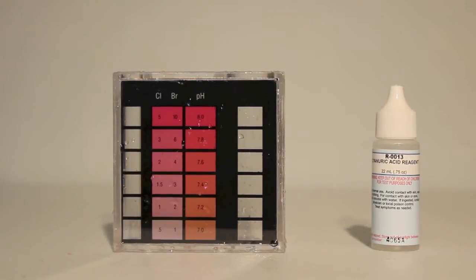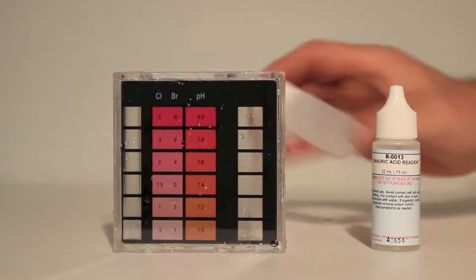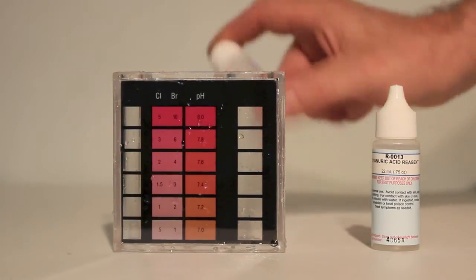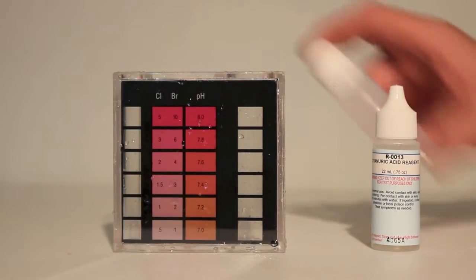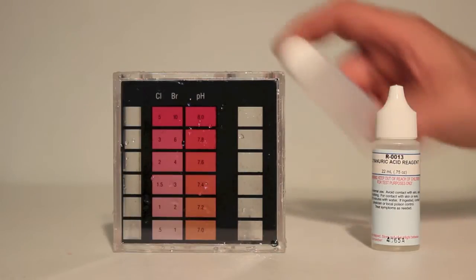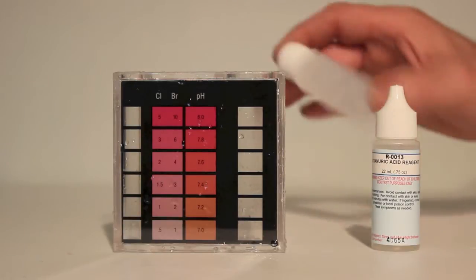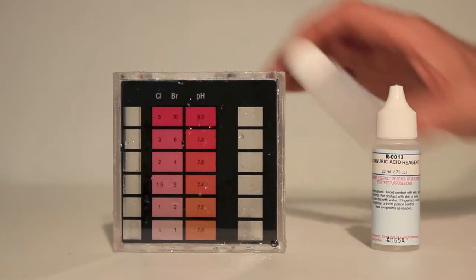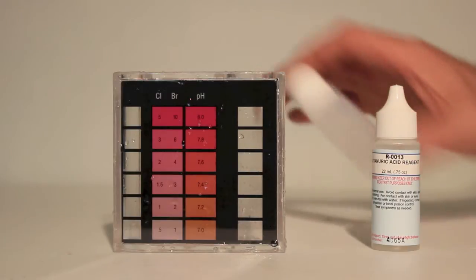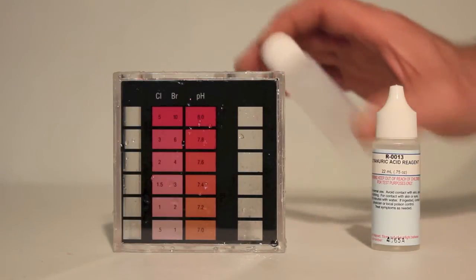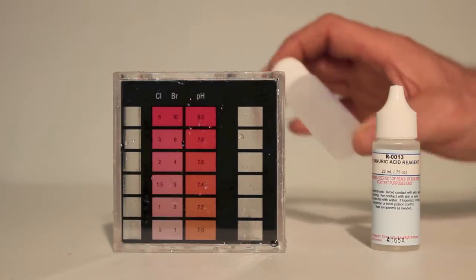So while we're shaking, we'll explain a little bit about what cyanuric acid is. Cyanuric acid is also called conditioner and stabilizer. It protects the chlorine from the ultraviolet light of the sun. It holds the chlorine in the water longer, which is why we use it outdoors and not indoors.